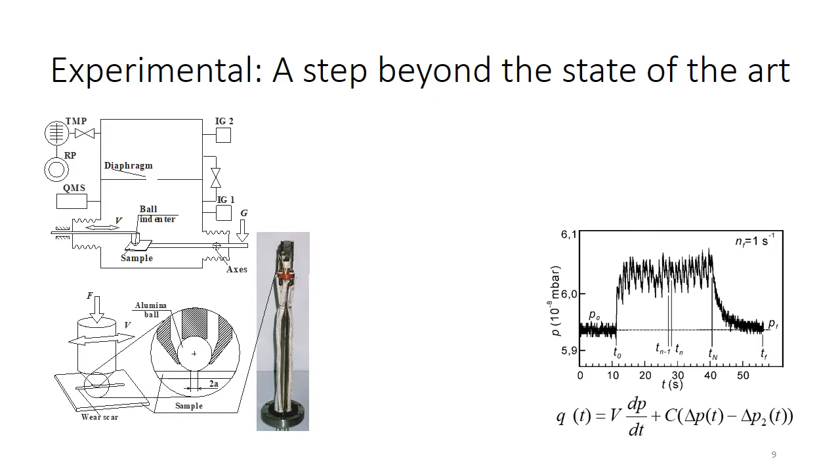Typically the vacuum system is where you place your tribometer and where the quadrupole mass spectrometer, or another type of mass spectrometer, is situated, and you can measure the gas emission with this device. What is very important is that the UHV system, ultra high vacuum system, should reach very low pressure, so you will have very low background, and you can distinguish the pressure increase due to friction very easily and with high accuracy.